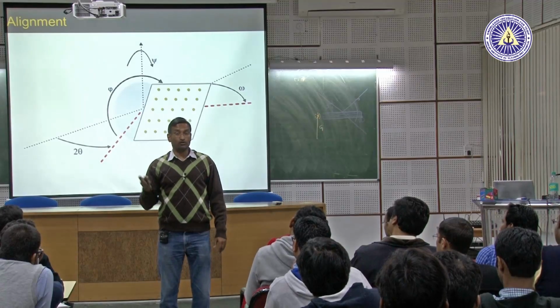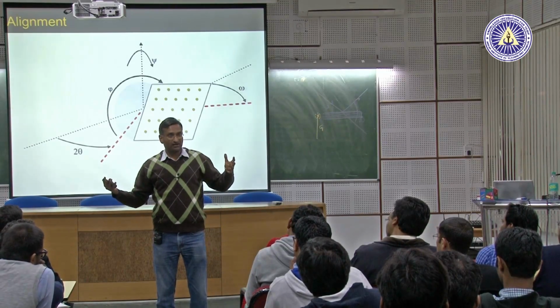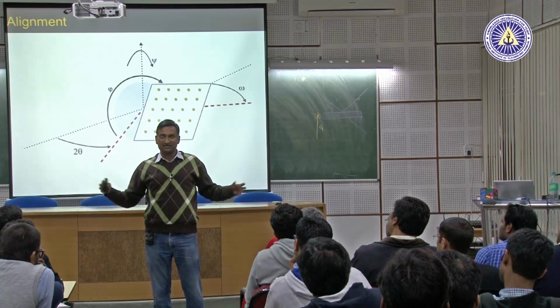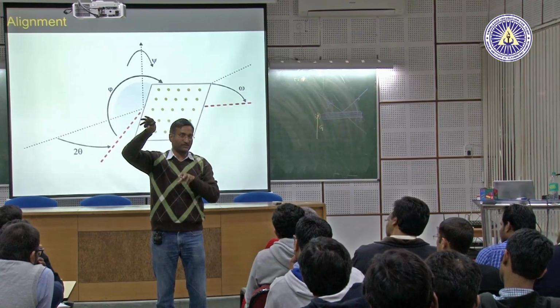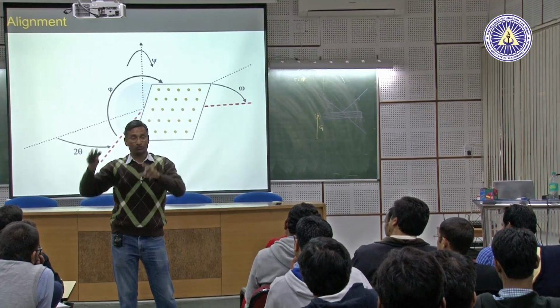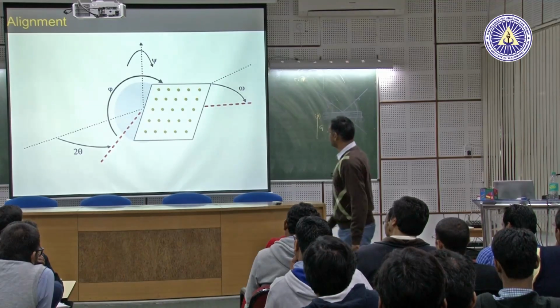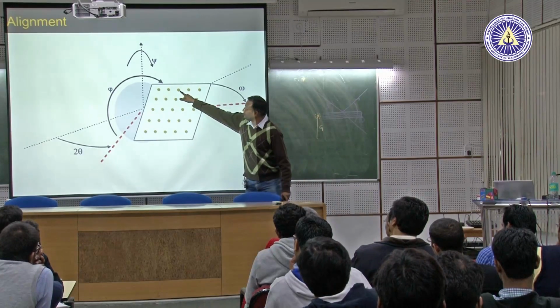On the other hand, you are also limited by the geometry, because you cannot collect the reflections which are at higher or lower angles. As a result, the number of spots to inquire within the Ewald sphere is very small. Not only are the spots fewer because of this restriction, your systematic absences may make it worse. So you don't have too many points to investigate. So what happens is that, suppose you want to investigate this particular point.